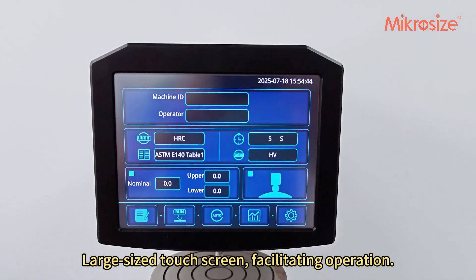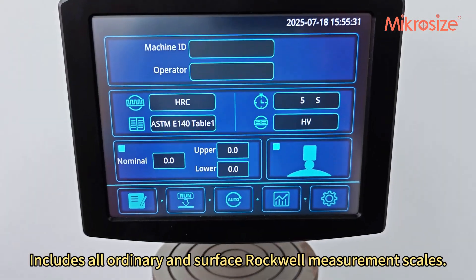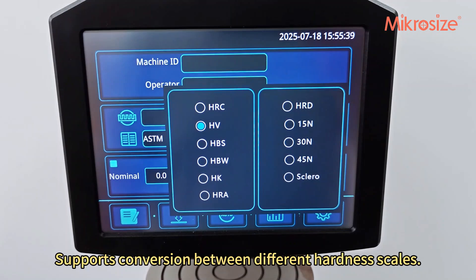The large-size touchscreen facilitates operation. The press head features an easy and quick replacement design, includes all ordinary and surface Rockwell measurement scales, and supports conversion between different hardness scales.